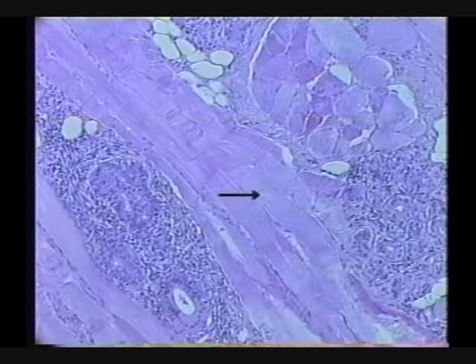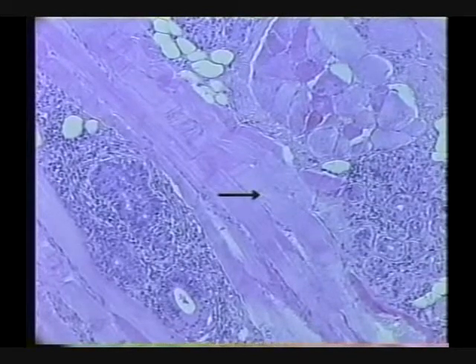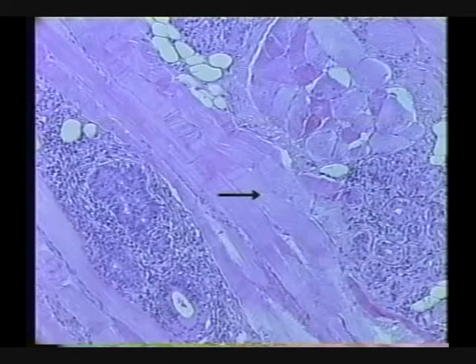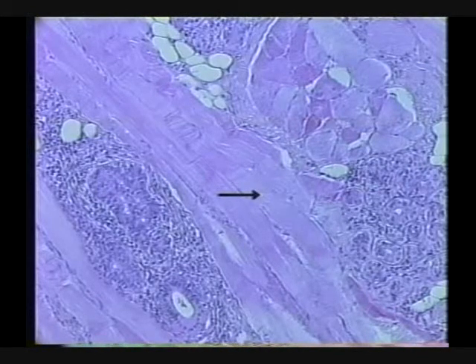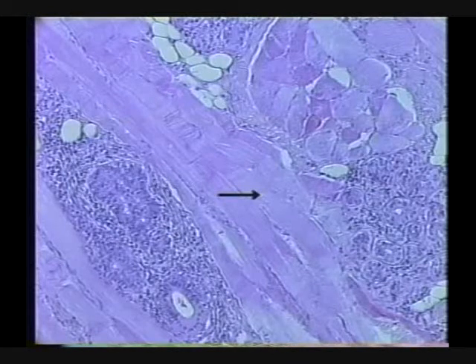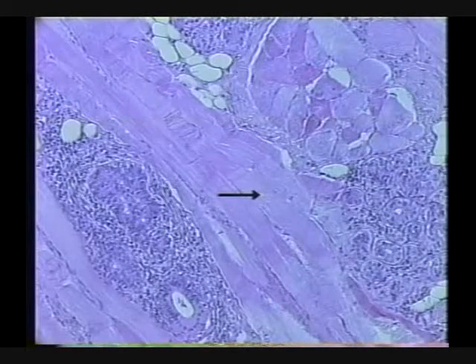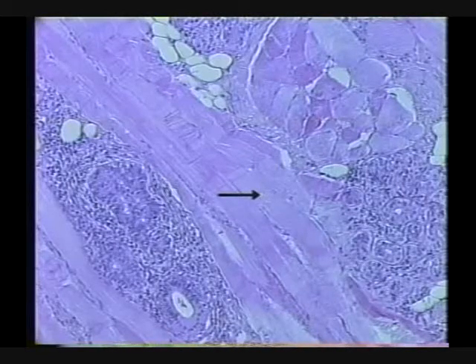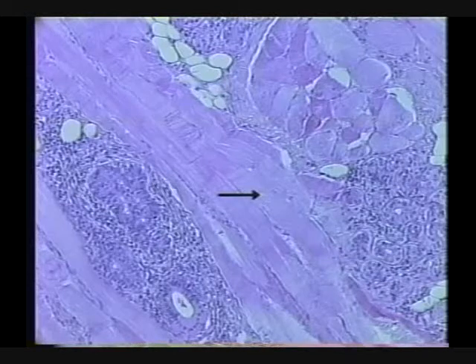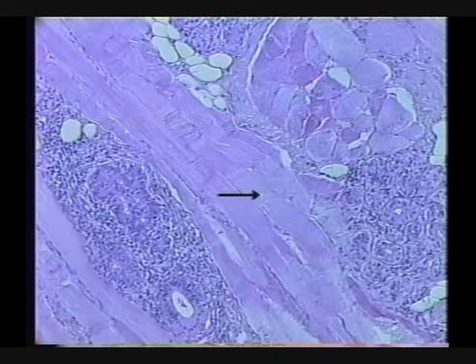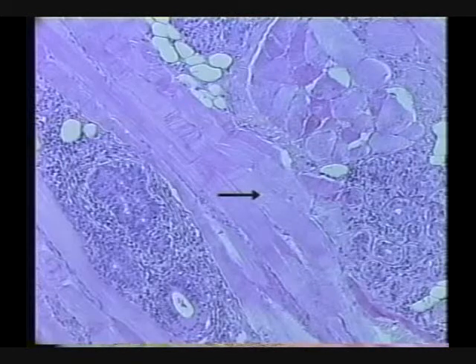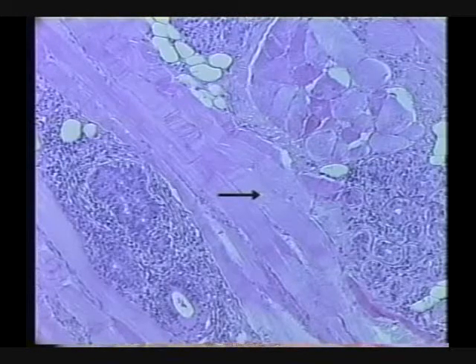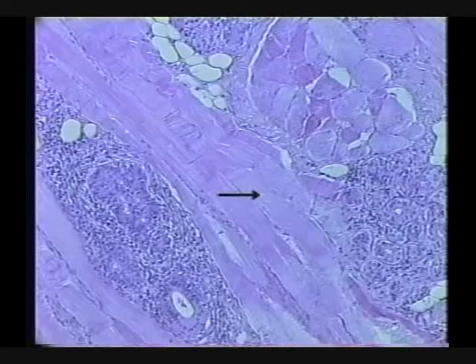Can you identify the tissue covered by the arrow? Skeletal muscle. Now can you see striations? I can't. Okay, maybe we can see some striations. I don't even see decent peripheral nuclei. What I hear from you is a familiarity that you look at it and it kind of feels right, that it's skeletal muscle, even though all the little details we've been pounding into your heads aren't really all there. You're becoming good at this.